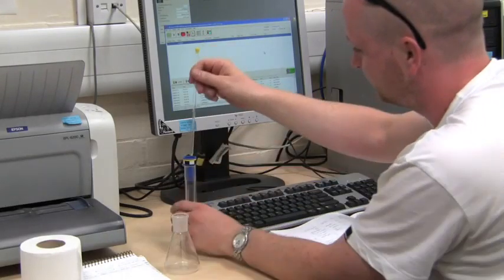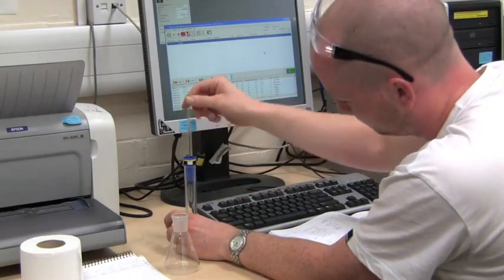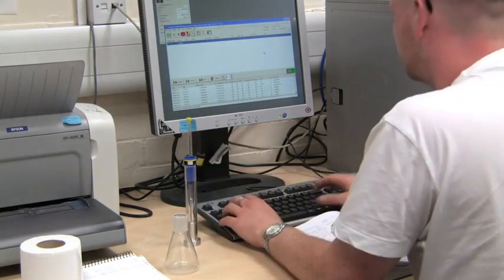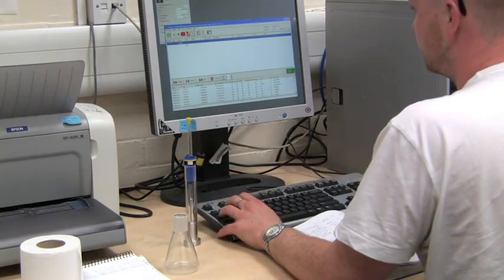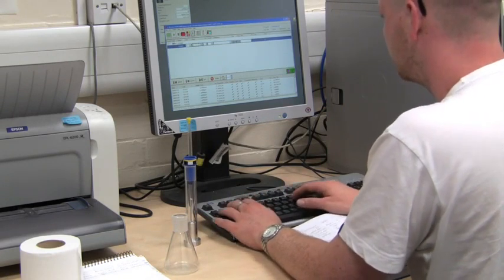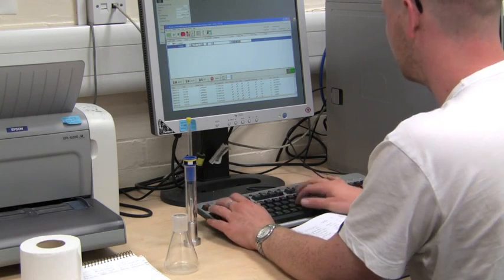After cleaning, the sample tube containing the sample is loaded into a spinner. A spinner houses the sample tube during the spectrum acquisition and protects it, allowing it to be rotated within the coil. The details of the sample to be run are entered onto the operating computer.